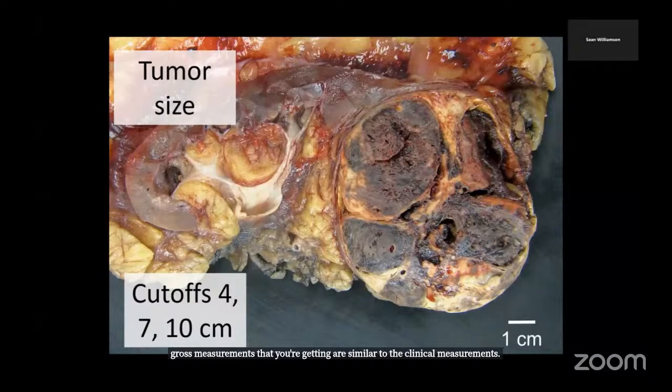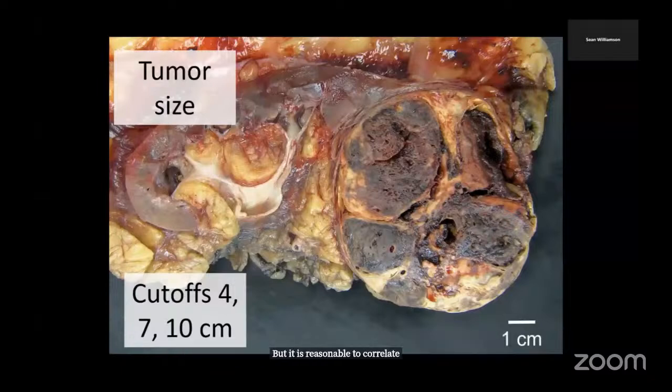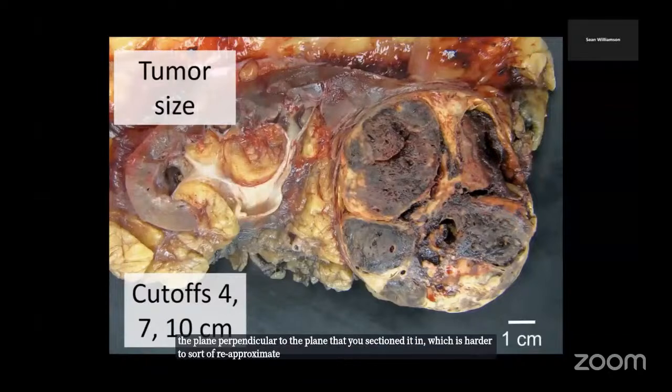There is some data suggesting that there may be slight shrinkage of the tumor from what is identified radiographically to the fresh unfixed specimen to the formalin fixed specimen. The size may be slightly decreasing across all of those measurements. But the exact amount of that difference in measurement has varied a bit between studies, and in general, it's not huge. But it is reasonable to correlate with the imaging to see if the tumor is right around one of these size cutoffs, especially if you think the largest dimension of the tumor might be the plane perpendicular to the plane that you sectioned it in, which is harder to sort of reapproximate and get the accurate measurement.